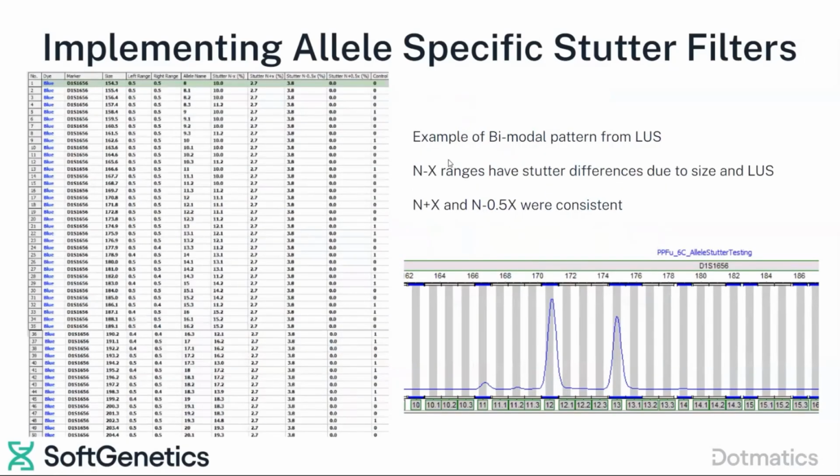Implementing the other example where there was a bimodal distribution, it's a little harder to see because it's a larger table, but basically it's going the whole repeat, and then we've got the .3 at a different value, the whole repeat and the .3. The 9.1 and .2 were included because depending on the location of the allele, you needed to have those for the .3 of something that was at a position other than an 11, 12, 13, other than a whole repeat value.